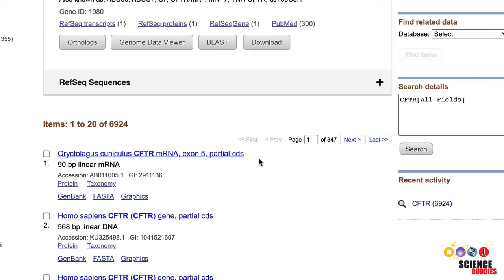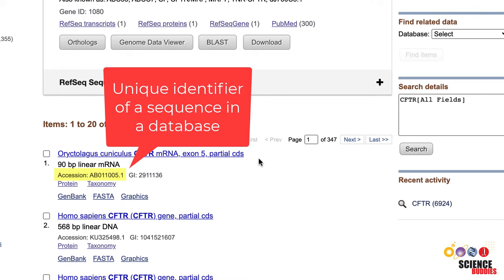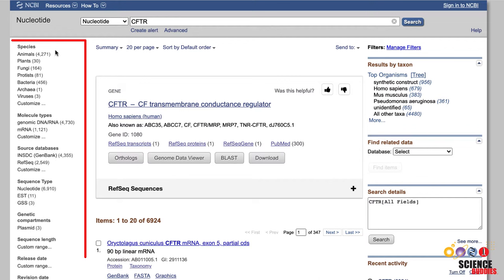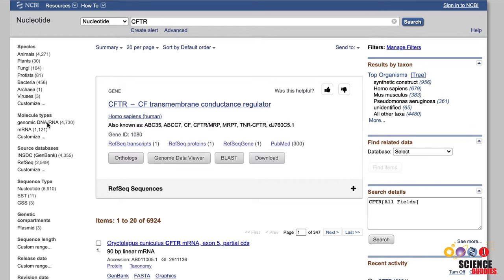For each item on the list, you can see its name, what organism it is from, the number of nucleotides, and its accession number. The accession number is a unique identifier given to a specific sequence in a database. On the left side of your search result page, you can filter your results based on species, molecular type such as mRNA or genomic DNA, source database, and more. On the right side, you see the results by taxon.